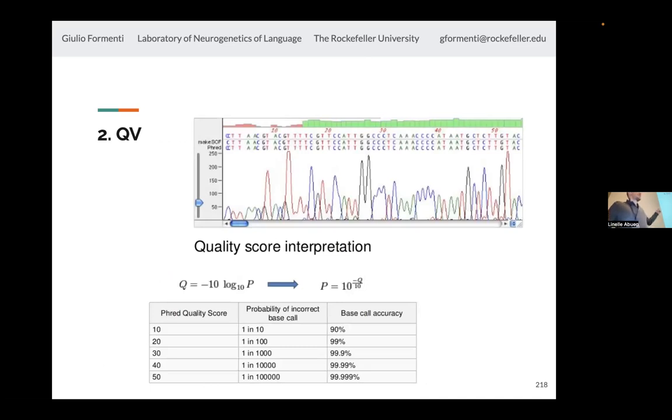What we have just calculated with Merqury, and we'll see the value for the actual example. Remember we're talking about this QV concept. That goes from 10 to, let's say, 100 in log scale again, so 1 error every 10 bases, 100,000, and so forth. We'll see in a second the estimate of the QV that we get. Merqury is using the k-mers to estimate the QV. It checks all the k-mers seen in the assembly and asks, is this k-mer also seen in the raw reads?